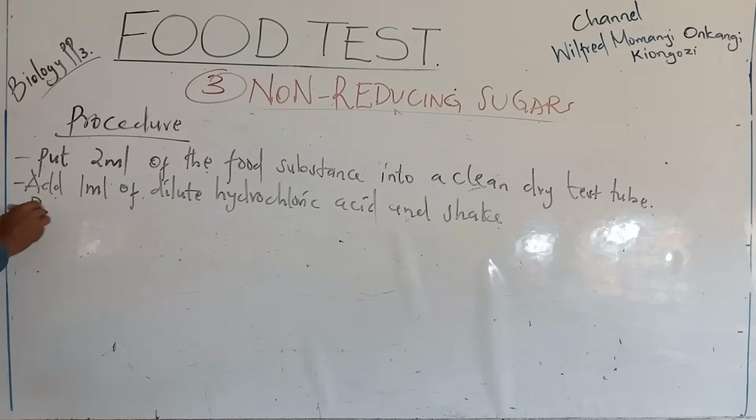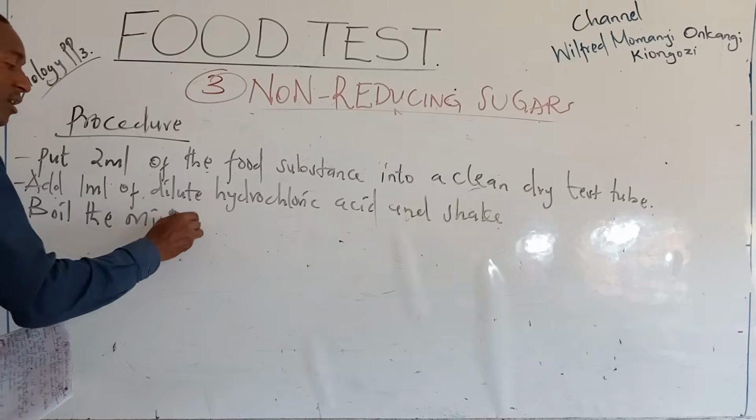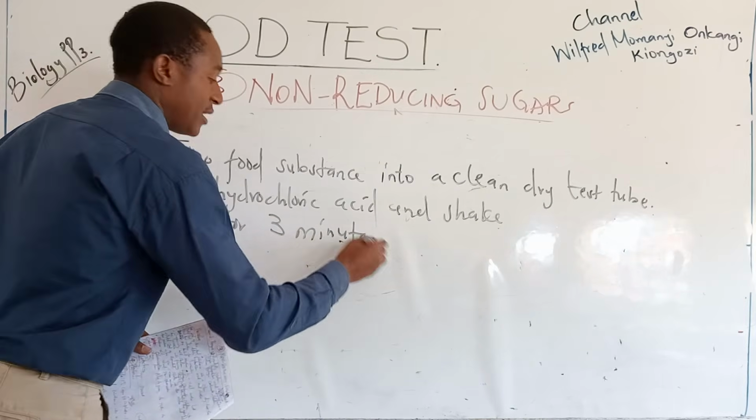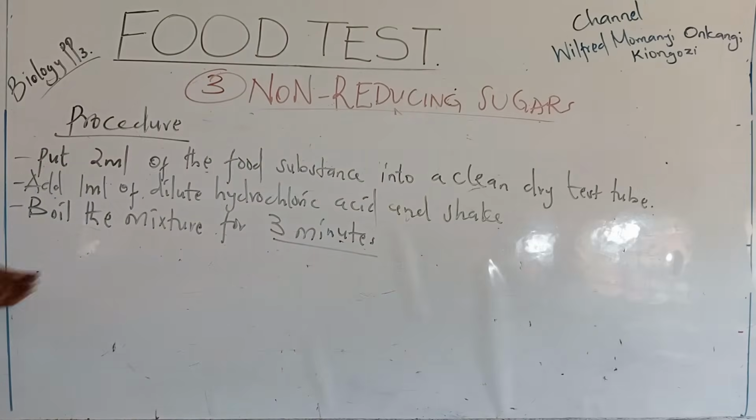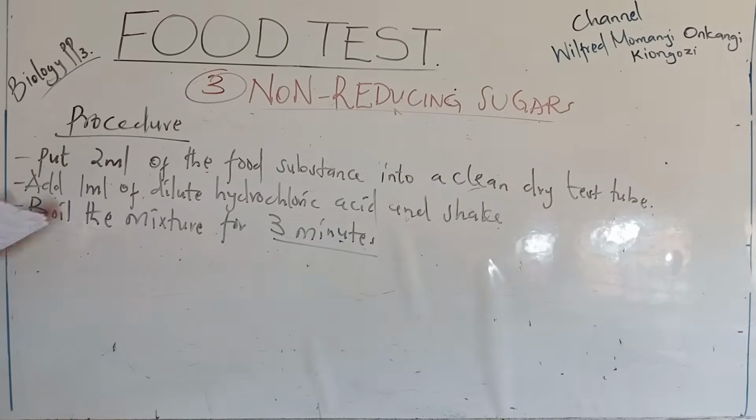So boil the mixture for 3 minutes. This is my decision to boil for 3 minutes. Otherwise, you can have 4 minutes and at most 5 minutes. You can also say heat the mixture, heat to boil.